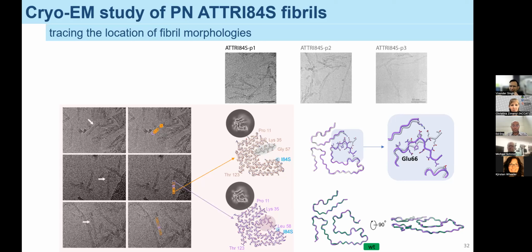So at that point, we tried to change strategy. We tried to use an overlap of a single layer during the extraction of these filaments in 2D and 3D classes, and that resulted in, I think, more particles.